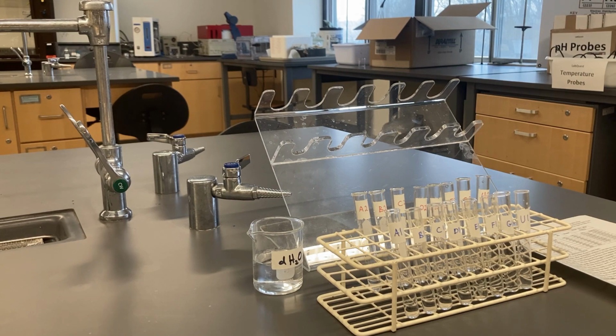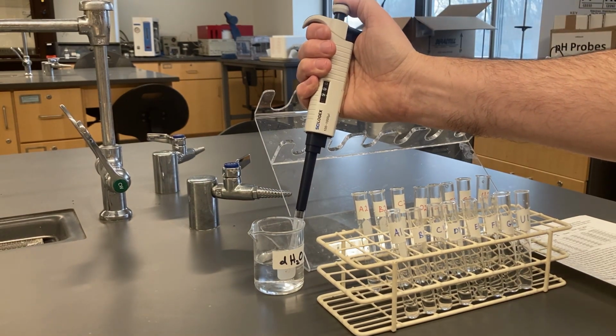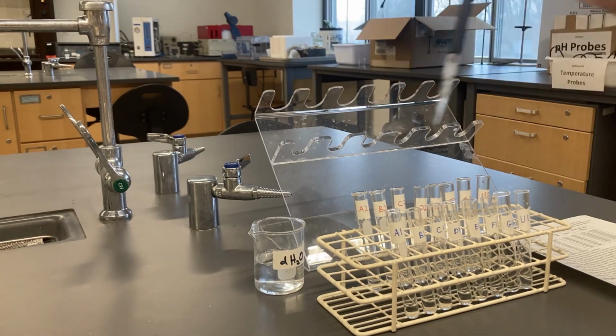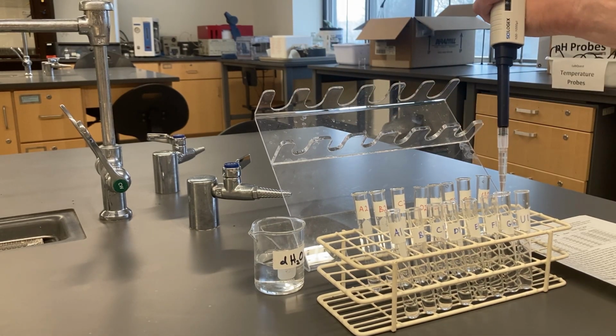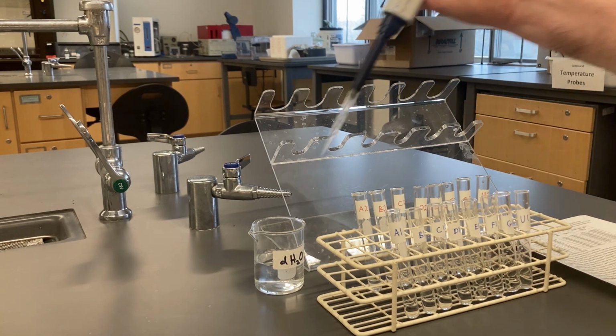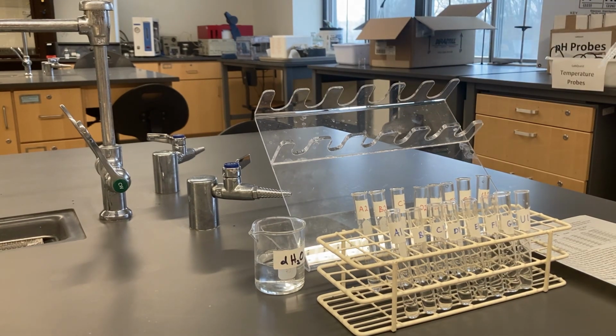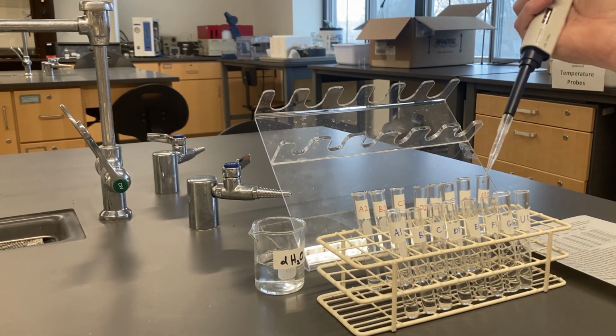Also, G1 is going to get 900 microliters, so I'm going to do that while it's set on 900, to G1. And then F1 is going to get 600. So that's 600 microliters of distilled water into F1, right?